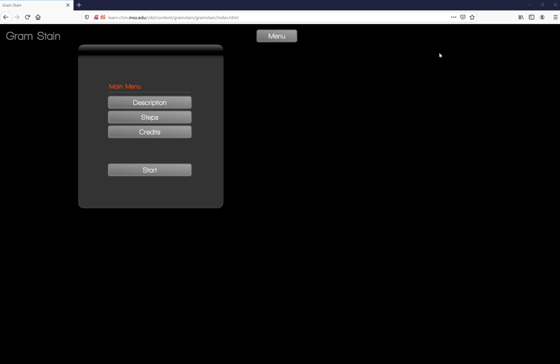Hi, this is Mrs. Alexander and I'm going to show you how to do your virtual gram stain using the website shown above.